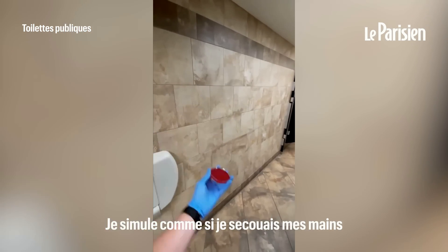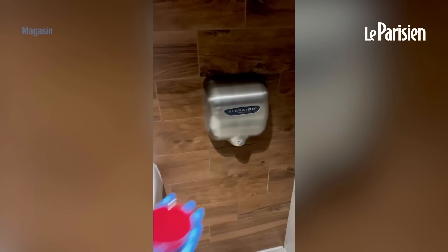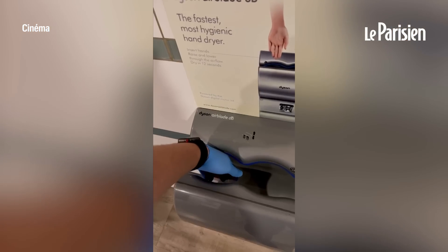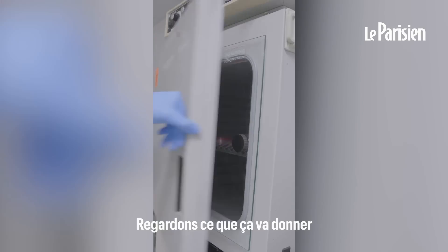To simulate shaking my hands dry — and that should do it. Then I went to a couple more locations to solidify my findings and put them all in an incubator to grow. Let's see what we found out.